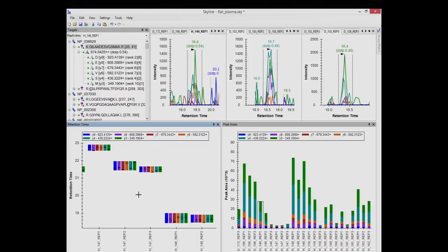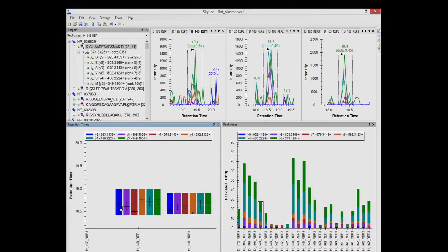You can maybe see, well, I think I'll pick things that are really close to retention time so I get big. So you can see that there are these lines. There's a line across the middle, and then there are these whiskers also. And what these indicate is the line across the middle is the apex. The bars are the base, so full width at base. This is showing where the integration boundaries are in time. The retention time is the y-axis.